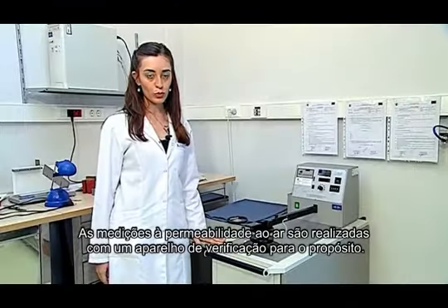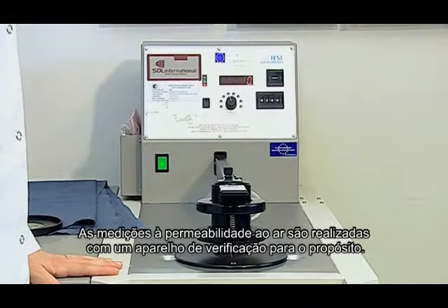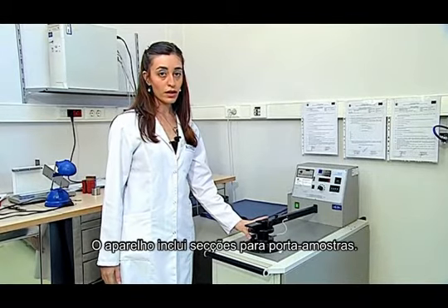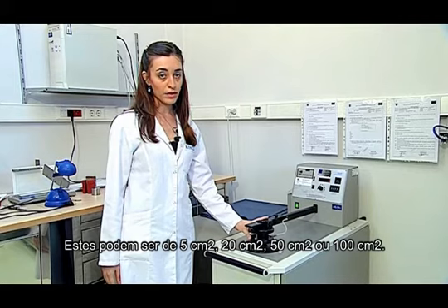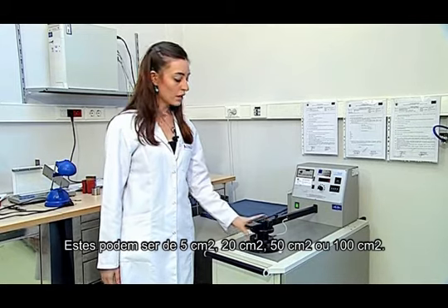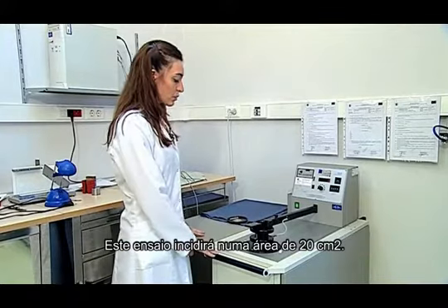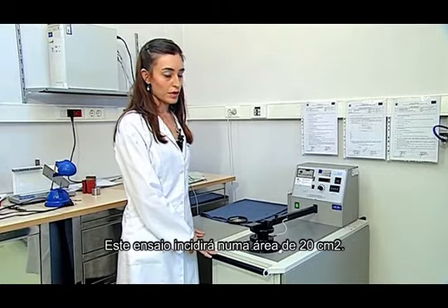Air permeability measurements are done with an air permeability testing device. There are sample holder sections in the device. These can be 5 square centimeters, 20 square centimeters, 50 square centimeters, or 100 square centimeters. Today, we will work with an area of 20 square centimeters.